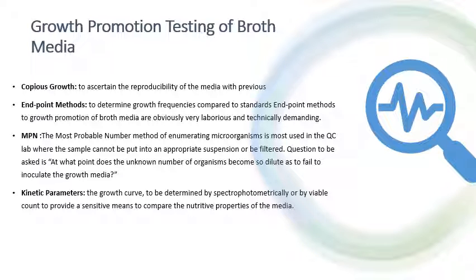In this type of experiment, it aims to investigate the critical dilution threshold beyond which the unknown population density renders successful inoculation of growth media ineffective, limiting the sensitivity of the most probable number MPN technique.